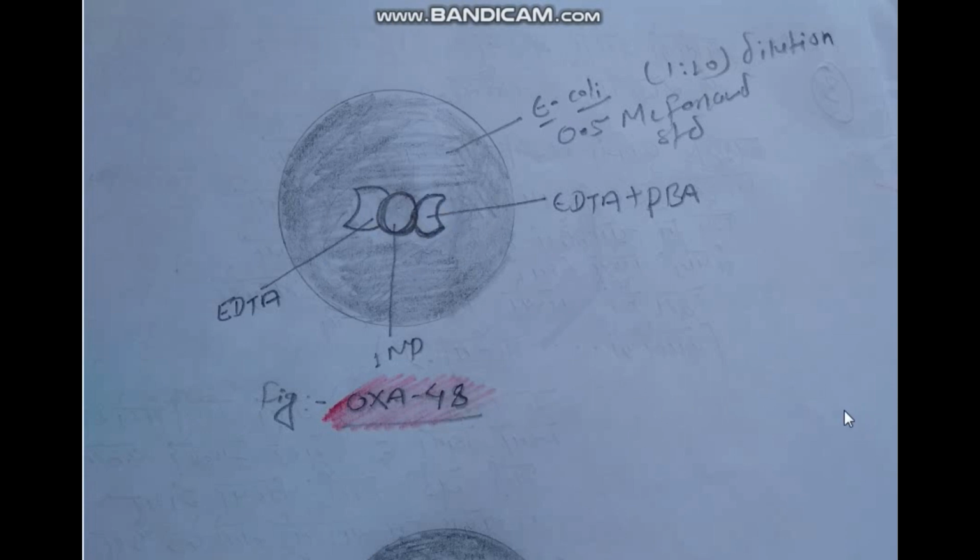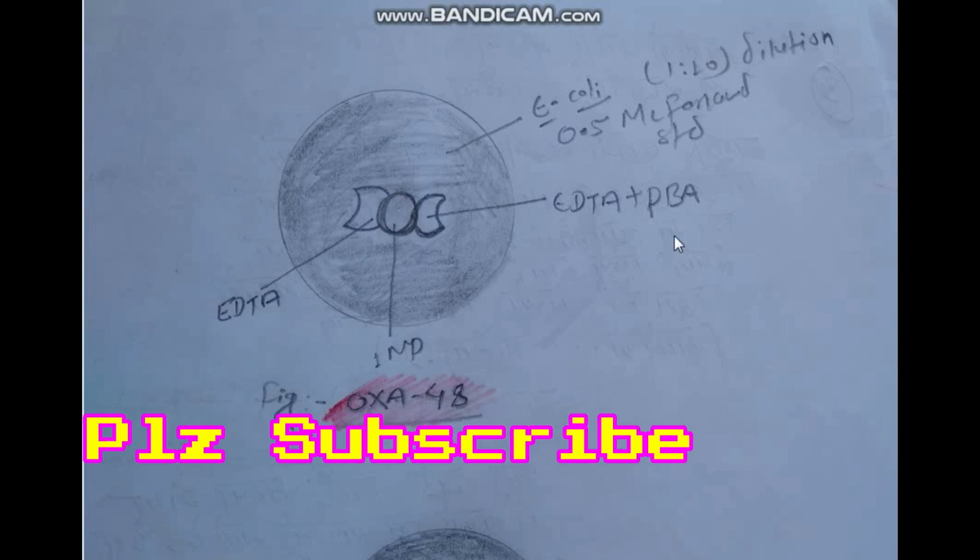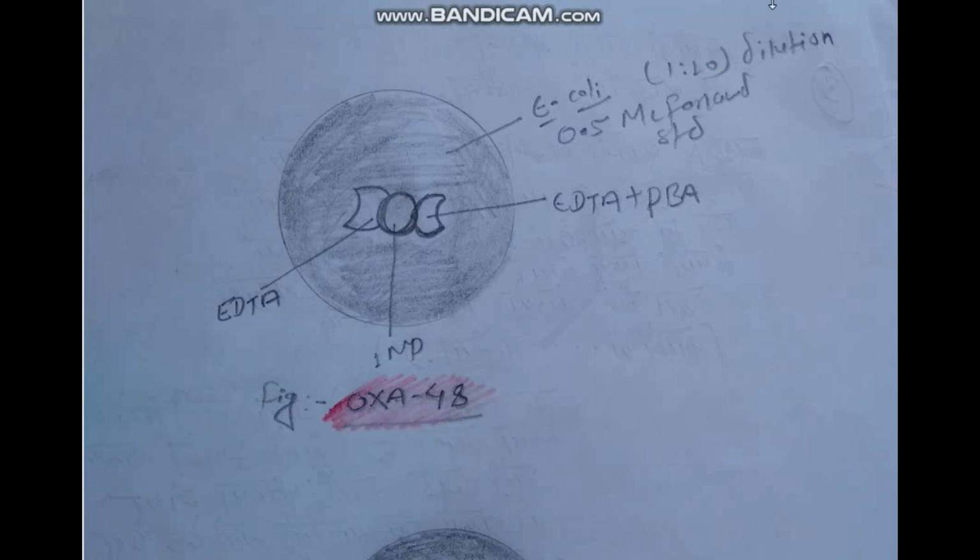Or for either the disc adjacent to the imipenem, the absence of distortion of the inhibition halo indicates no significant inactivation of imipenem, so the result will be negative. But here we can see flattening of the zone of inhibition, so the result is positive.